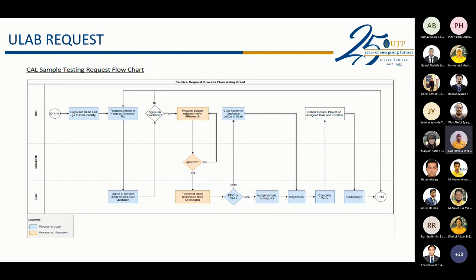Next question. How do we calculate lattice constant and dislocation density? Lattice constant, you can always find it from the database.